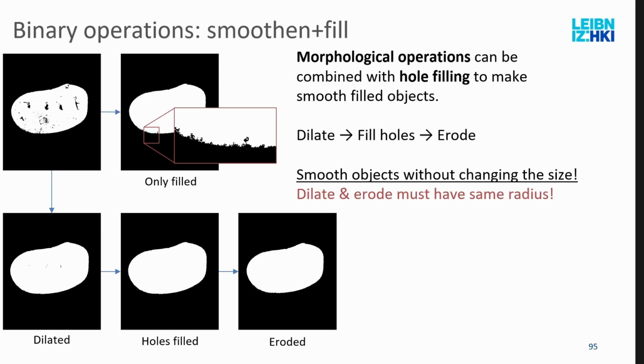And then using these existing operations, you can make a standard pattern, we would call it, where you can combine it together with these classical morphological operations. So this is literally from the kidney data and one of the published workflows that it does. This is a paper.